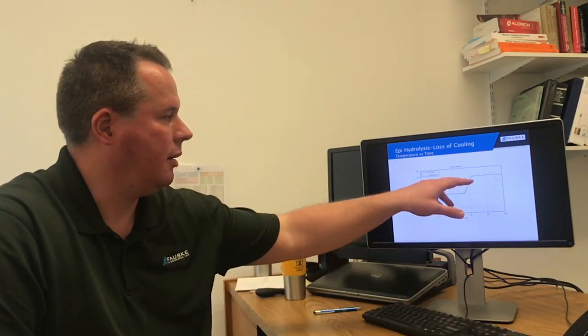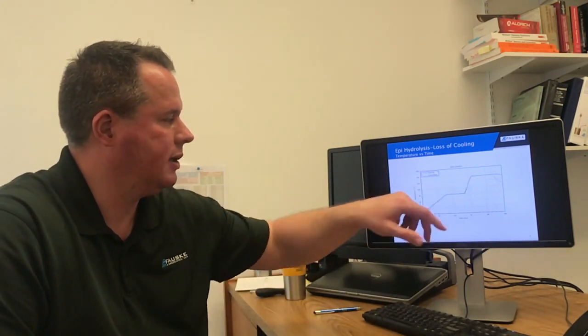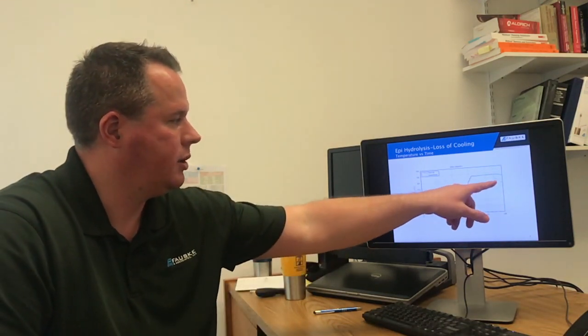It looks very much like it's a rate controlled addition. So with the catalyst and the temperature of the process, it's pretty much reacting at the rate that it's being added into the test cell, as opposed to typical standard Arrhenius kinetics. So after we stopped the addition and we saw that the temperature was not increasing, we turned off the heaters and allowed the system to cool.